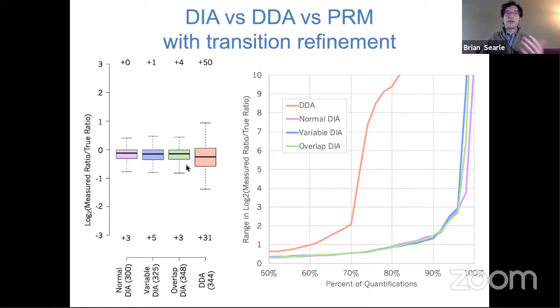And so this is actually really important, I think. One of the problems we typically have with DDA is that we make detections and then quantify everything and say they're all good measurements. And I think one of the issues with precursor ion integration is that not all of those measurements are actually representative of reality. Many of them actually show interference. But when you only have a precursor, a single peak or a single set of peaks, to make a quantitative assessment, then you don't have very much information, and you have no ability to throw out particular fragment ions or specific measurements.